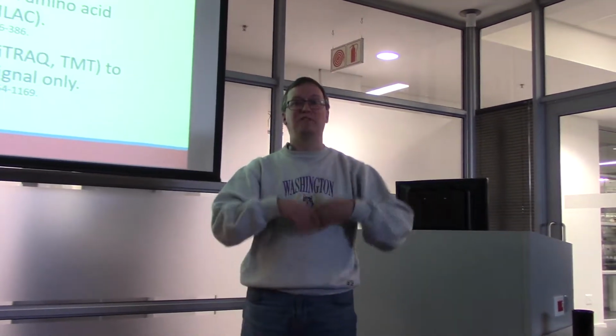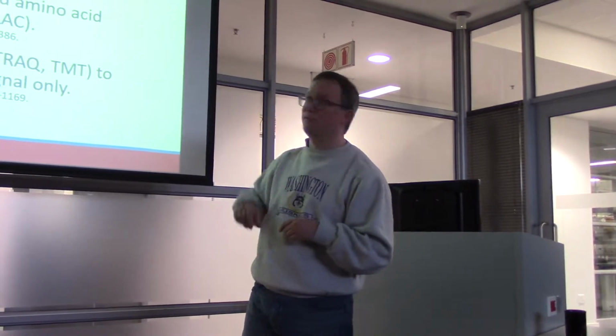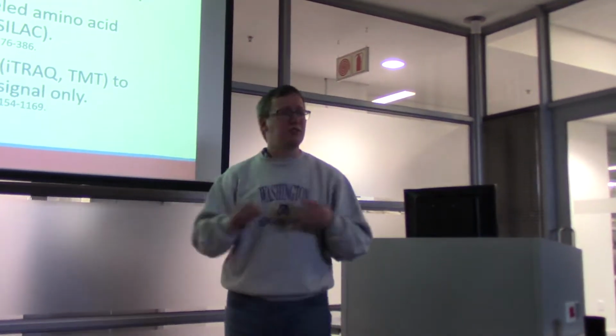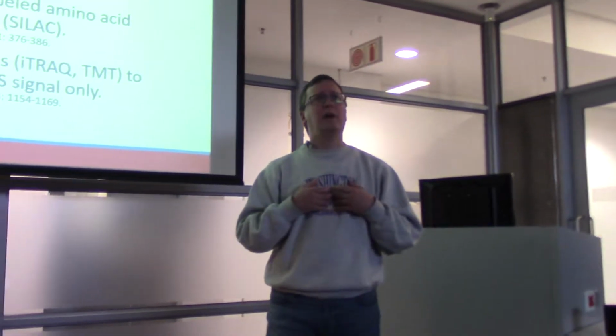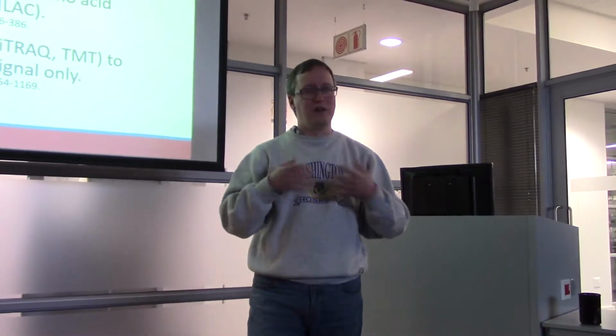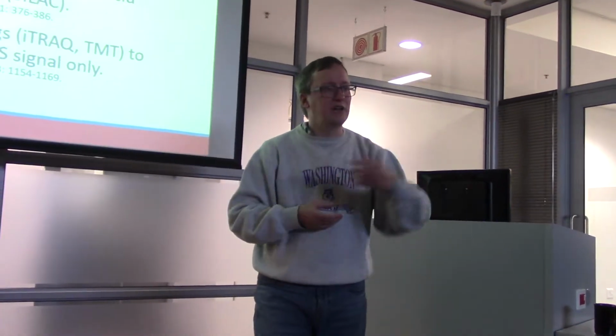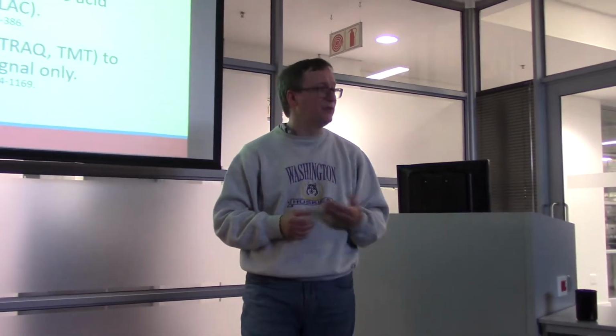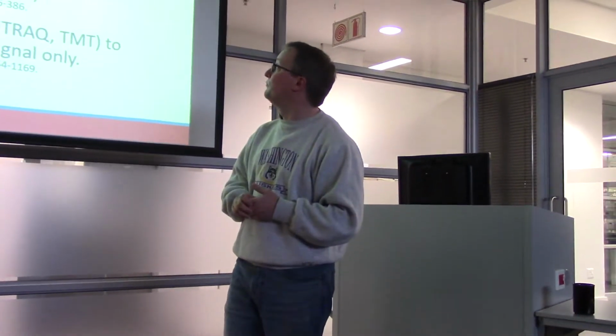So that's an example of metabolic labeling or constitutive isotopic labeling. All right, some people will do that with nitrogen as well. So again, if you're not able to incorporate nitrogen from the atmosphere, then you're getting your nitrogen from somewhere else. Being able to change that to a heavy labeled version over time is very valuable.